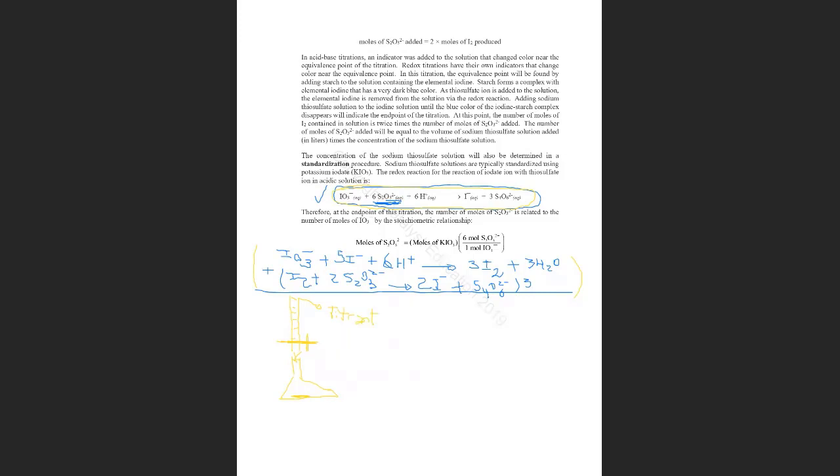Very good. So what is a titration? It is a quantitative technique of slowly adding one solution of known concentration, the one in the burette right here, our titrant, using this piece of glassware called a burette, to another solution of unknown concentration, our analyte.